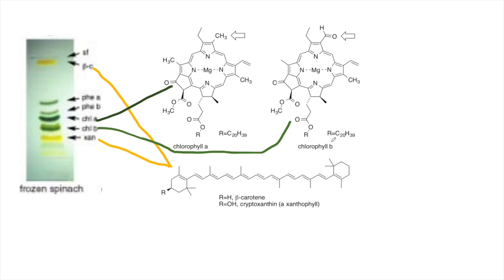Okay, so here is a TLC. You might recognize it from your homework set, but this is spinach extract. So you can see lots of different spots on this TLC plate. A lot of times we would do this in person if we could. So I just want to point out a couple of the spots here.